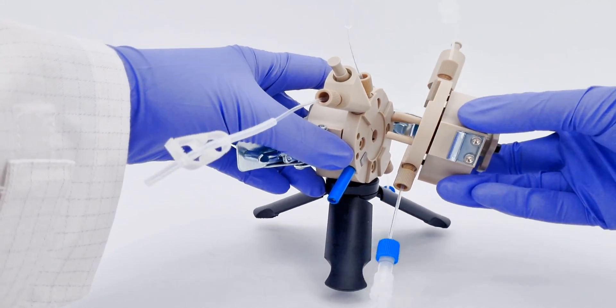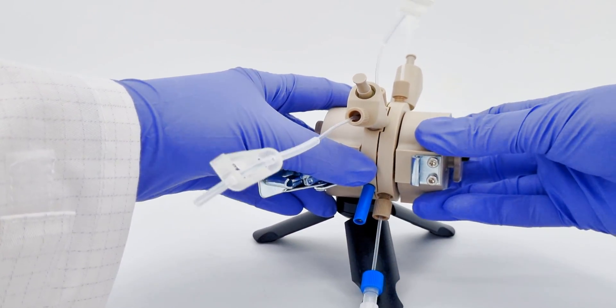Reunite the two halves of the cell, ensuring correct alignment and subsequently clamp them together.